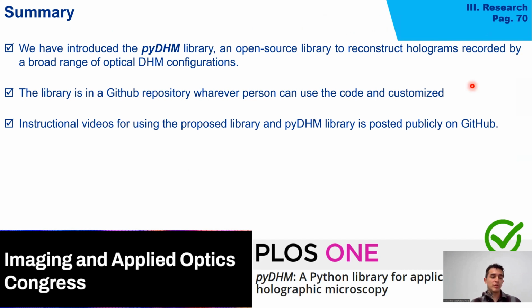brief summary of the PyDHM library. We have introduced PyDHM, an open source library to reconstruct holograms recorded by a broad range of optical DHM configurations. The library is in a GitHub repository. Whatever person can use the code and customize it.